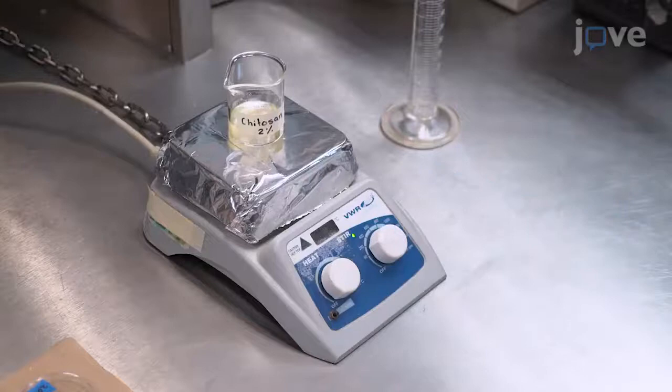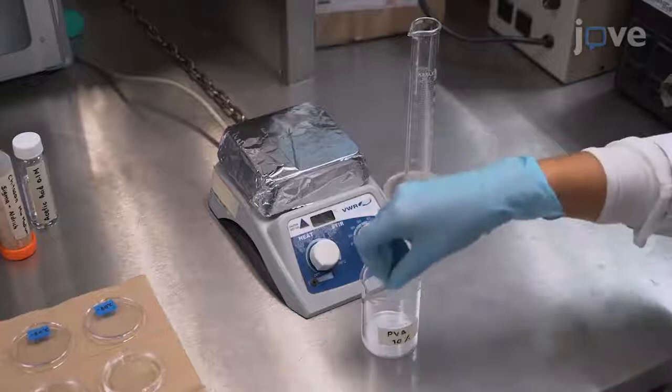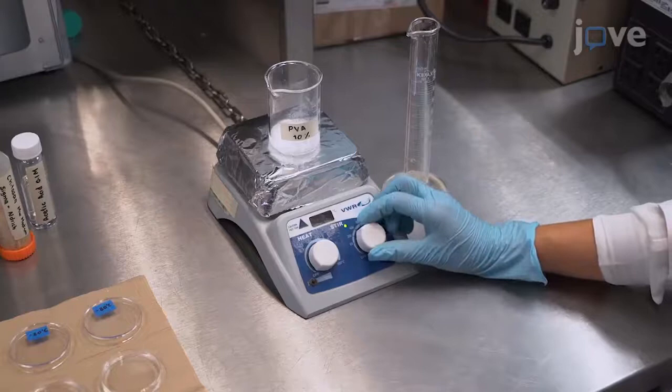The next day, dissolve 1 gram of PVA in 10 milliliters of distilled water and stir at 80 degrees Celsius for 1 hour. Then use a magnetic stirrer to mix an equal amount of both solutions at room temperature until they are homogenous.